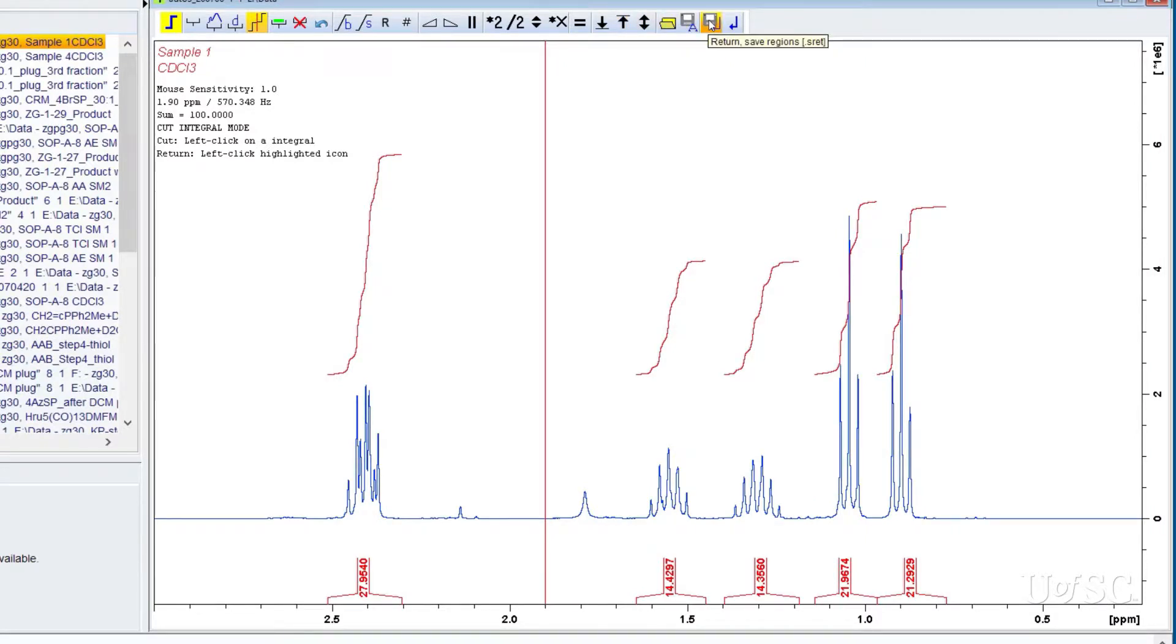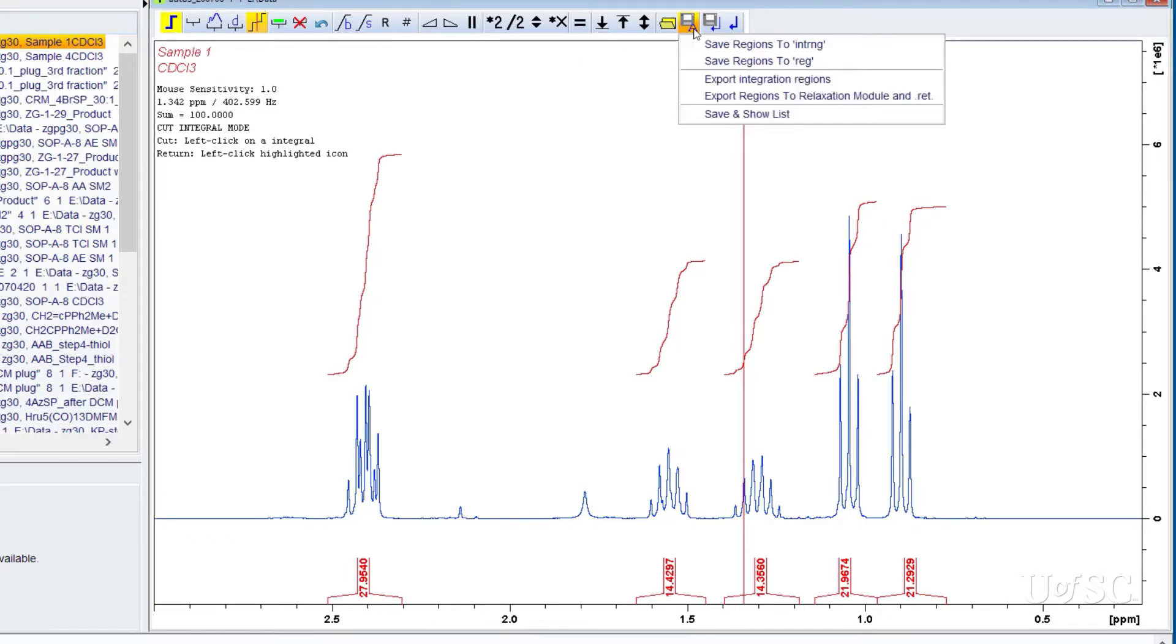Abandon your changes with the button with only the return icon. The save as button, with the A in the icon, will allow you to save integral regions and apply them to other spectra. This is very useful for analyzing multiple samples with similar composition.